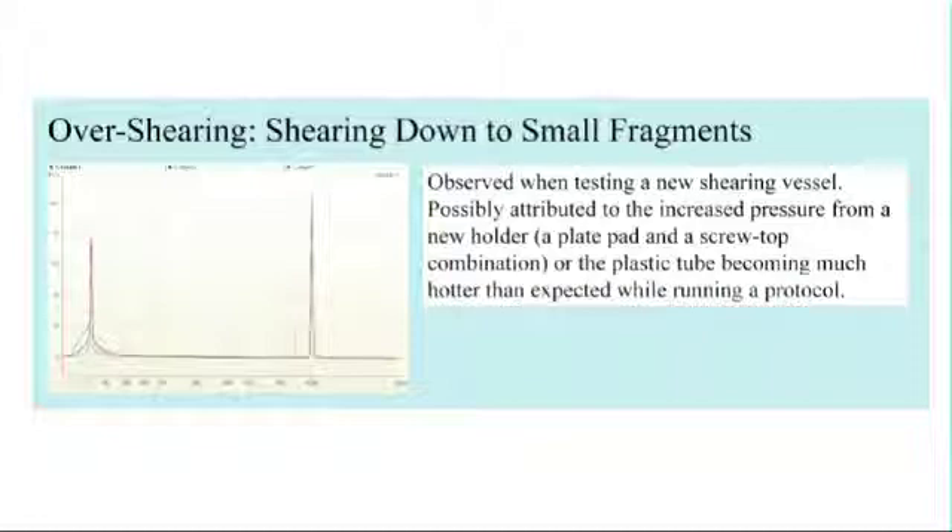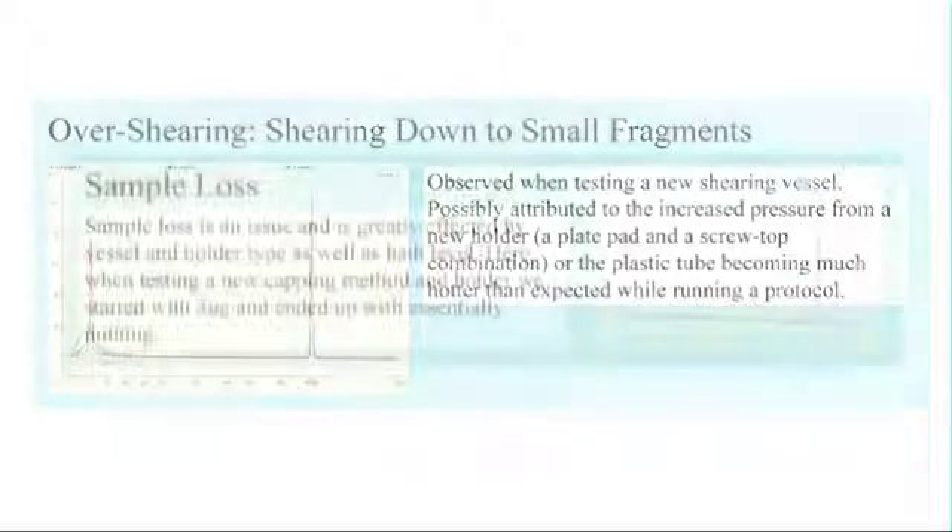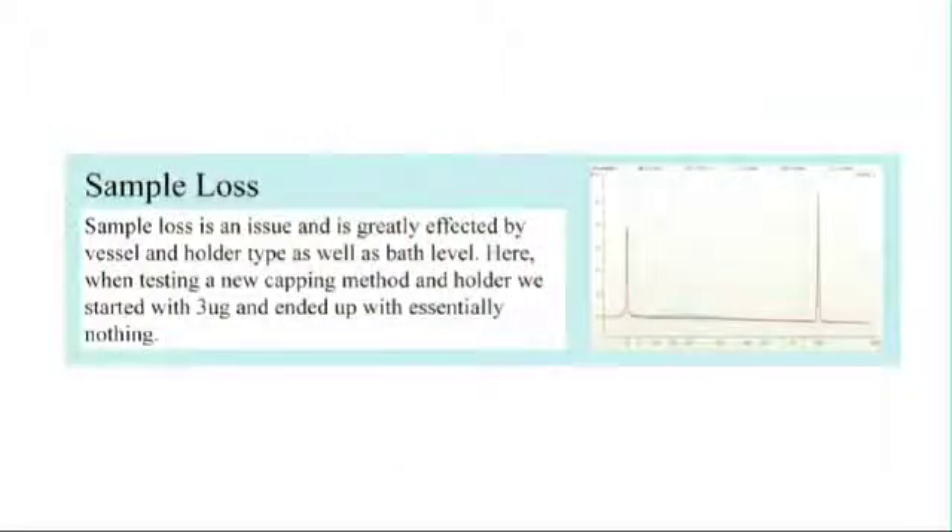In this section, we focus on how even a shearing tube holder, which seems inconsequential, can make a huge difference in how the sample shears. When we tried a new tube holder with a screw-on cap, the pressure built up in our tubes, heating up the DNA and causing it to shear down to small oligos. In this image, we show that even though the bath water level seems insignificant, it must be carefully controlled. If we set the water level too high, then the water can flood the tubes, especially if we're using snap caps instead of screw caps. Sample can seep out of the tubes and water can seep in, causing cross-contamination and sample loss. Maintaining the proper bath level is critical.